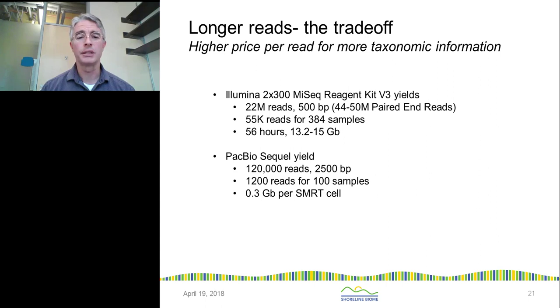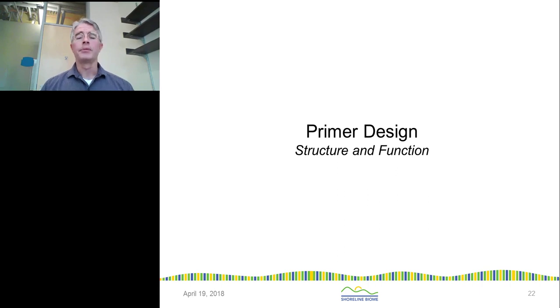The sequel instrument that is some of the data that I'll be talking about with you today, you can put in about 100 samples on that and get pretty good levels of information out. So that's what I'll be talking about mostly down below. The next challenge, primer design.